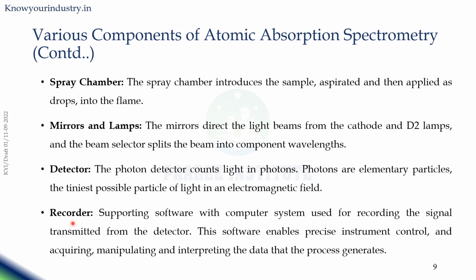The recorder is a computer system supported by software that measures the signal transmitted from the detector. The software enables precise instrument control and acquiring, manipulating, and interpreting the data generated in the instrument.